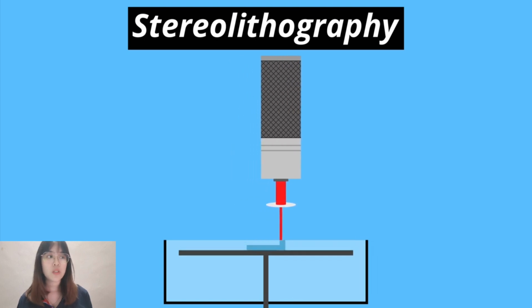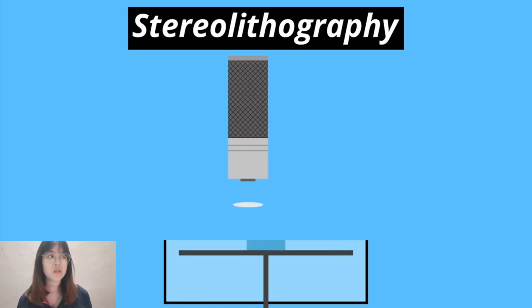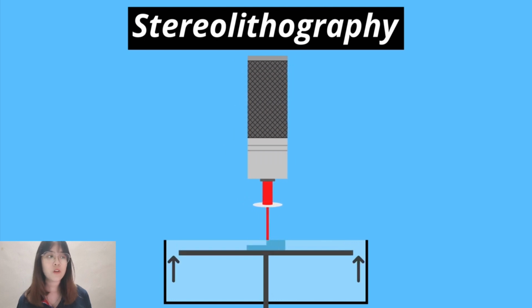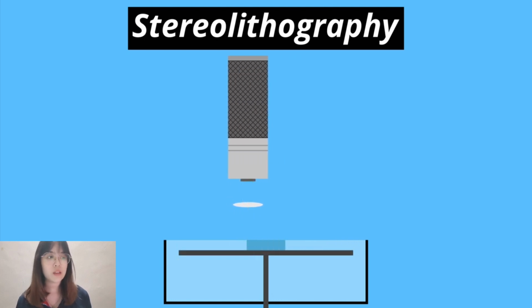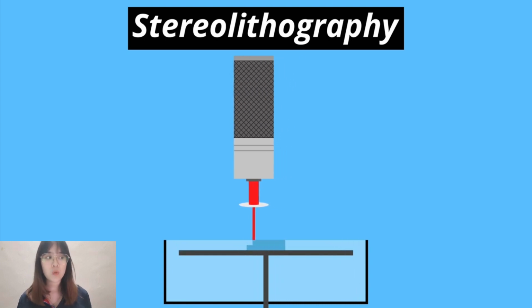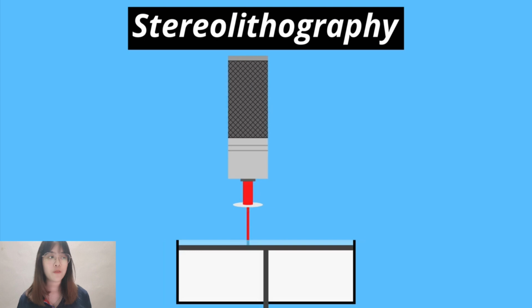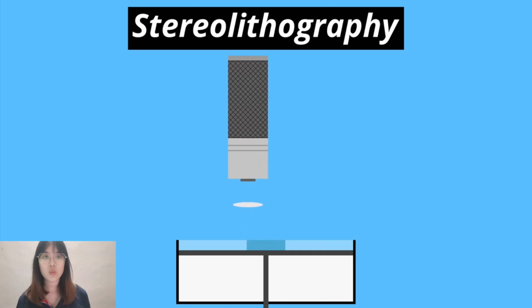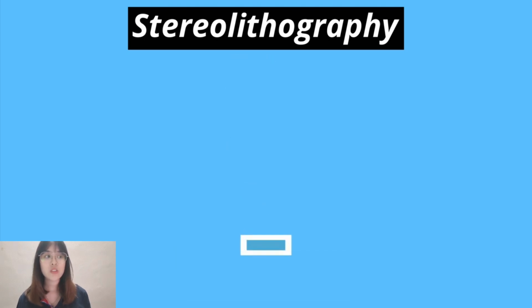If in doing so the platform is immersed in bioink, then a fresh coat of bioink will flow on top of the now hardened layer of bioink. Or if the platform has sidewalls, then a fresh layer of bioink can be coated separately. This process is repeated, eventually leaving you with a solid 3D structure once the liquid bioink is washed away.